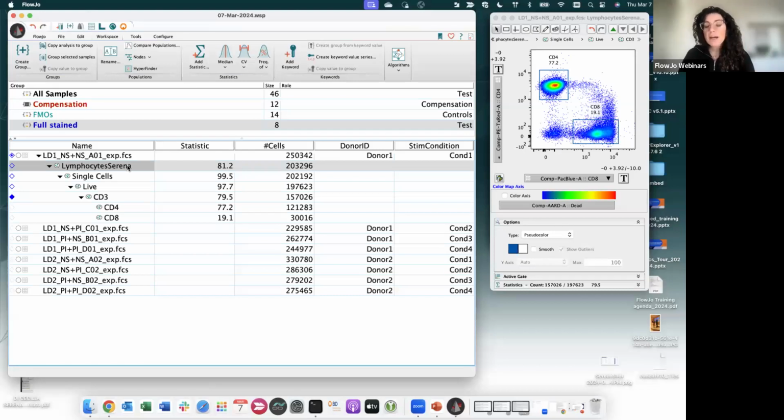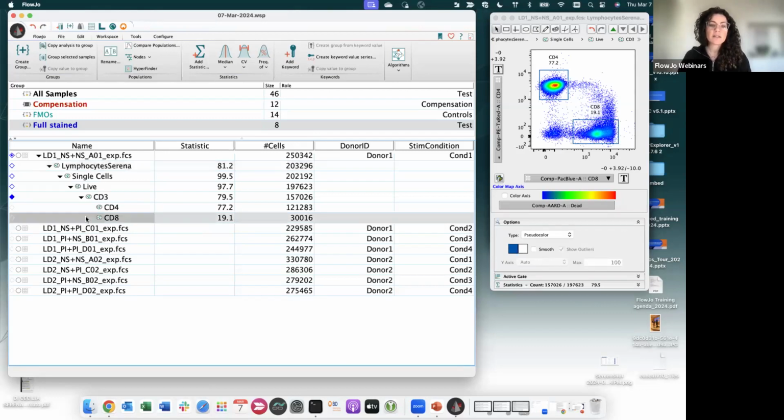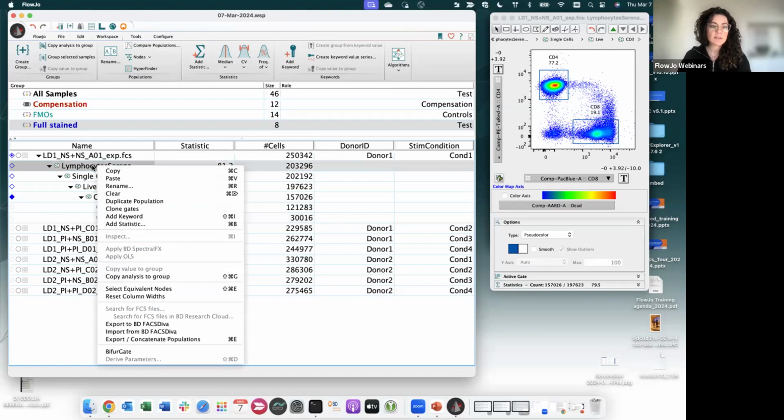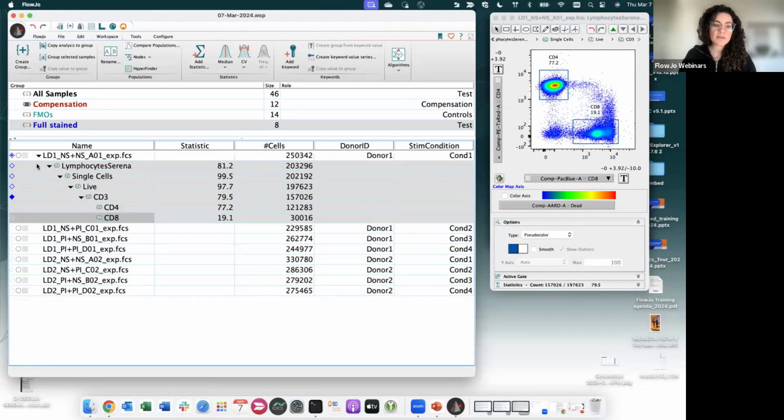So you have two options, up to you. You can go on to the next sample and start everything from scratch. Okay, start analyzing the next sample with the same gating strategy, restart creating the gates, or you can take the gating strategy from your lymphocytes to the CD8. Okay. And you can just drag and drop the full selected items, okay, the full gating strategy onto the group.